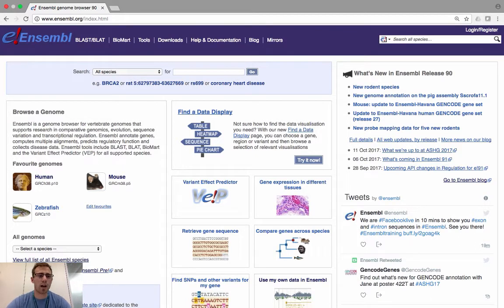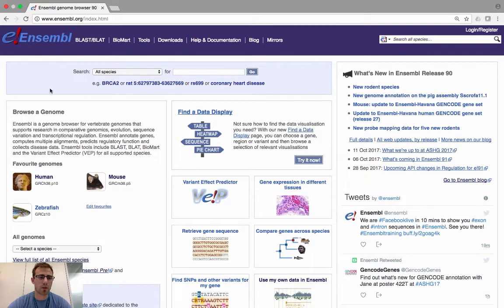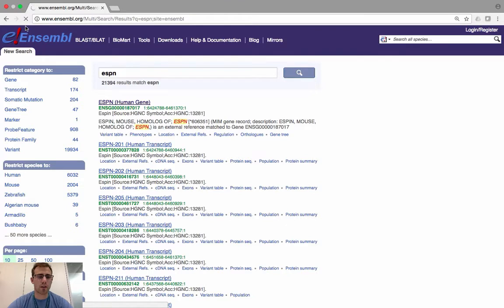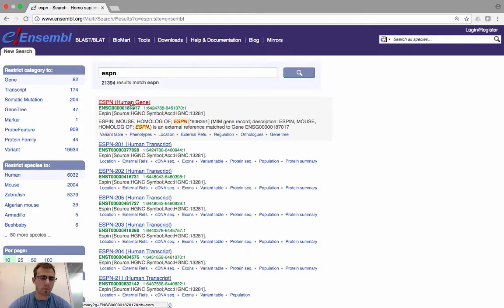First, navigate to the Ensembl homepage at www.ensembl.org. You might be familiar with this page already, but if not, you can search for a gene of interest using the blue search bar at the top of the page. Click on the search bar, type ESPN, and then click Go. This will take you to a search results page displaying all features within Ensembl that match the ESPN search term. At the very top you can see ESPN, which is the human gene — this is the link we want to click on.